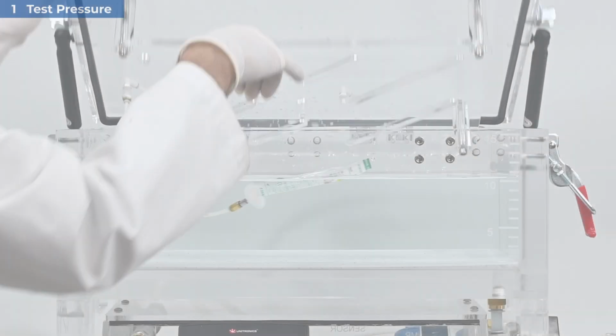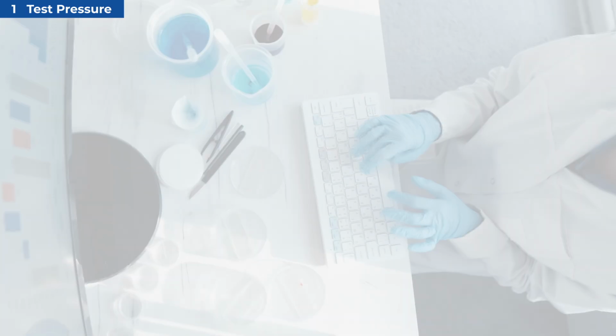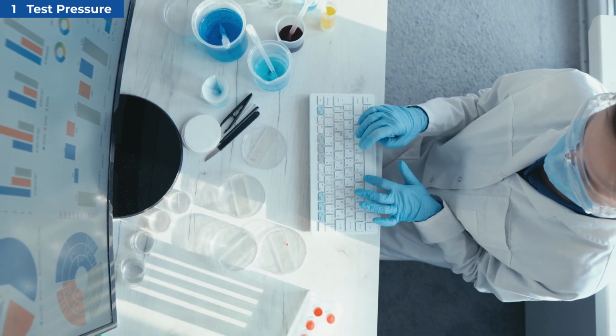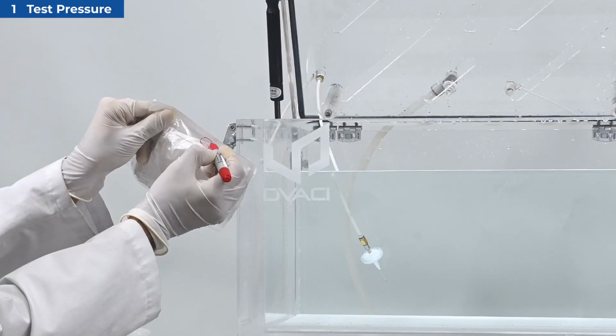The standard establishes a clear principle. The package is pressurized under water and observed for a continuous stream of bubbles that would indicate a leak. Each laboratory must establish its own test pressure and holding time at pressure using a validated methodology. This is where the control sample becomes essential.